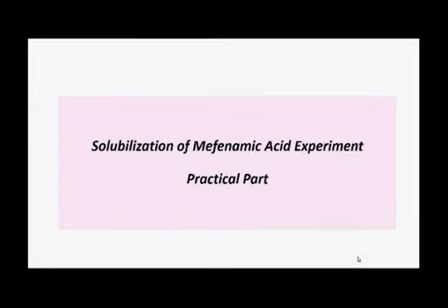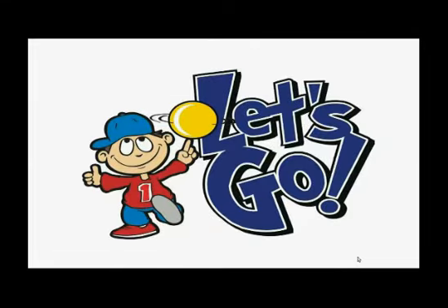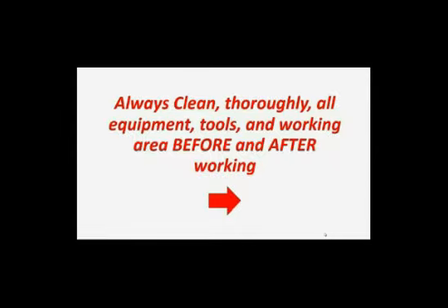Hello everyone. In this video, we will show you how to do sample analysis for both solutions prepared under the pH solubility profile construction experiment and the effect of co-solvent ethanol on the solubility of mefenamic acid experiment.